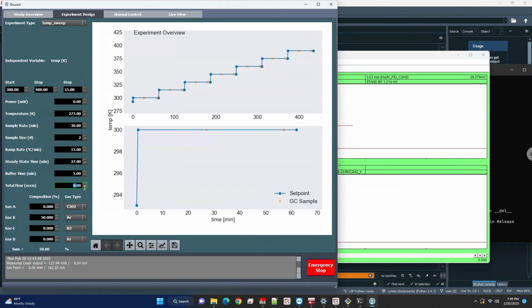You always have to set some flow rate. So in the GUI that populates at 0, but that needs to be some value.